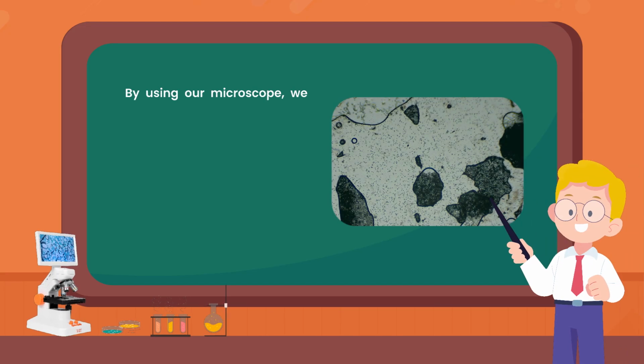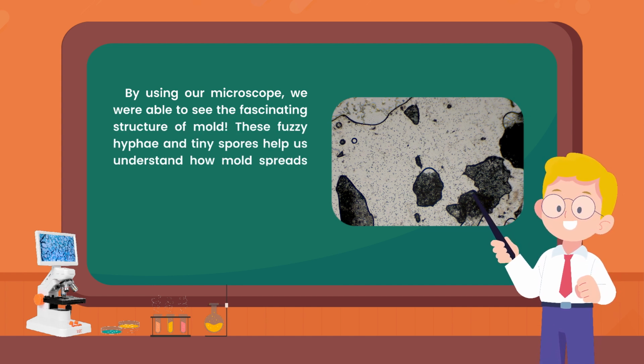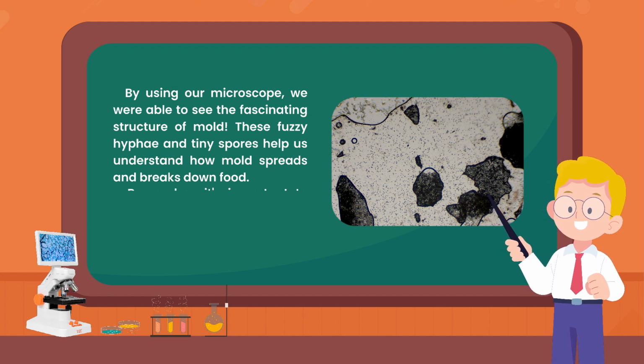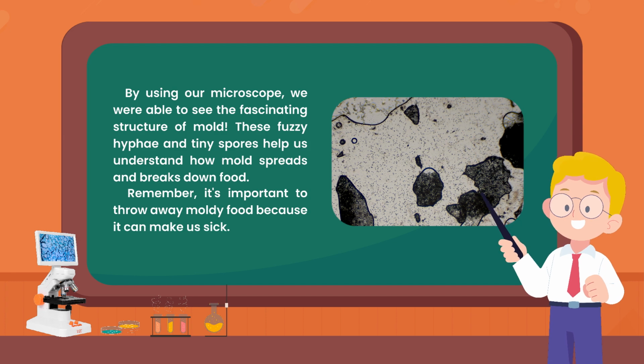By using our microscope, we were able to see the fascinating structure of mold. These fuzzy hyphae and tiny spores help us understand how mold spreads and breaks down food. Remember, it's important to throw away moldy food because it can make us sick.